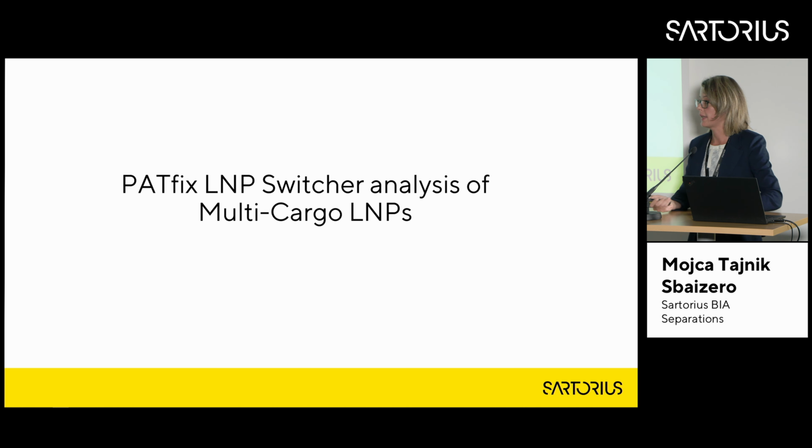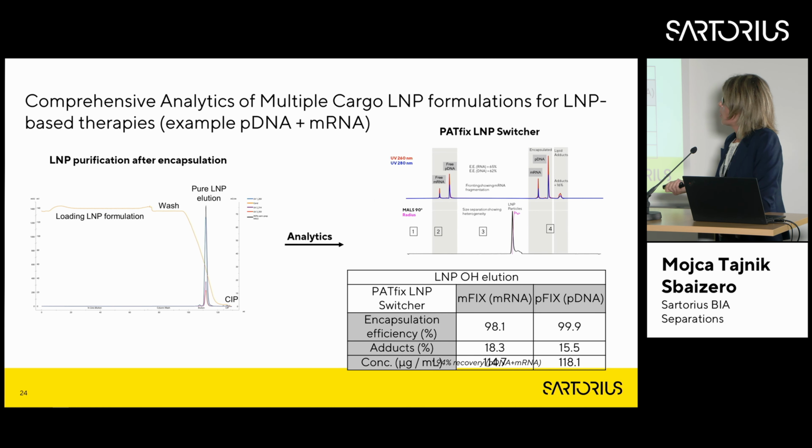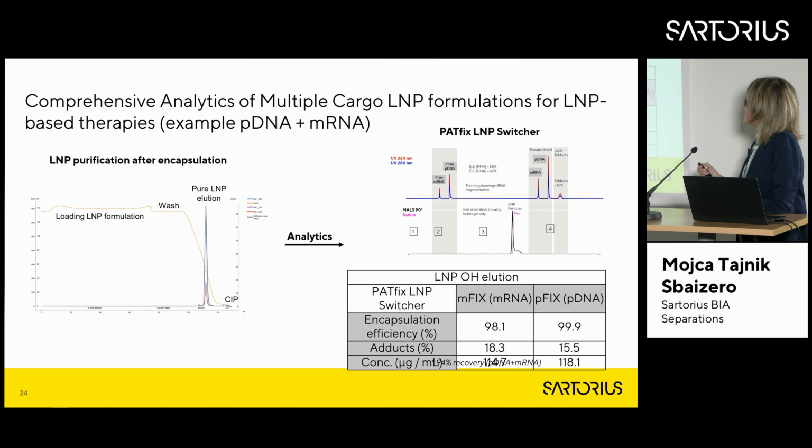If I move again back to the multi-cargo LNPs, this is the example I showed before for the activity where we encapsulate pDNA and mRNA at the same time. We analyzed this also on the PATfix Switcher. And here is the chromatogram, so loading, washing, elution. But in this peak, we cannot see what is with the payload. So we collect this fraction and send it to the analytic department. Then they gave us this result.